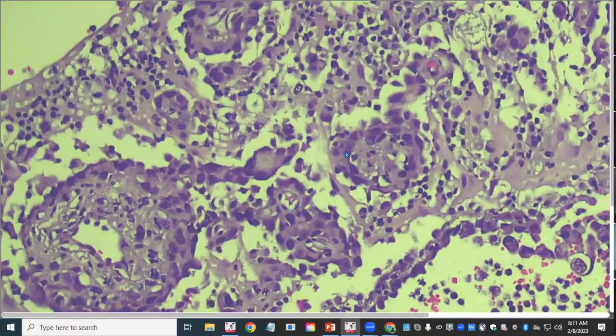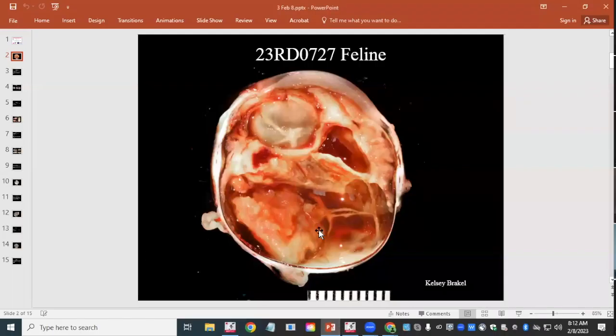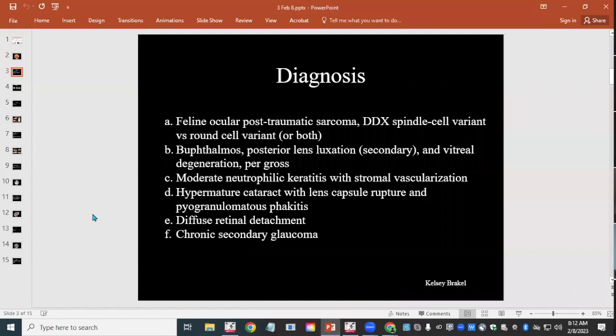In some locations the neoplastic cells have formed the shape of a vessel. The diagnosis is feline ocular post-traumatic sarcoma, with differentials of the spindle cell variant versus the round cell variant, given the biphasic morphology, retinal invasion, and coating of the inner uveal tract. We weren't confident we could differentiate the two, and speculated both may be present.